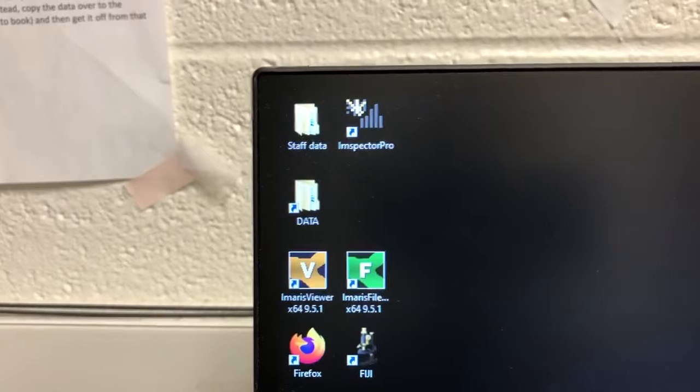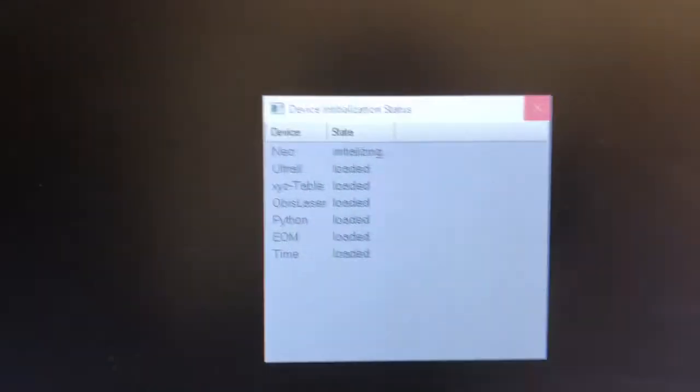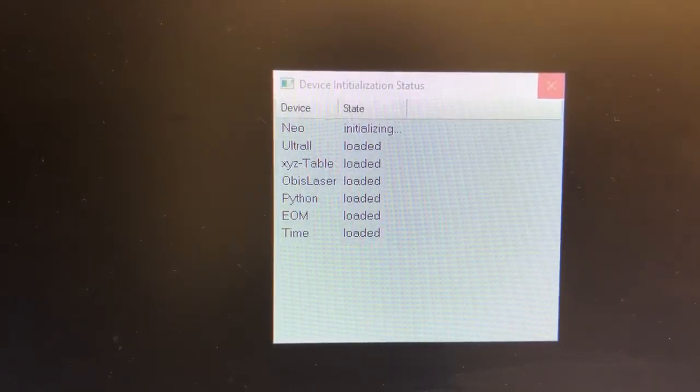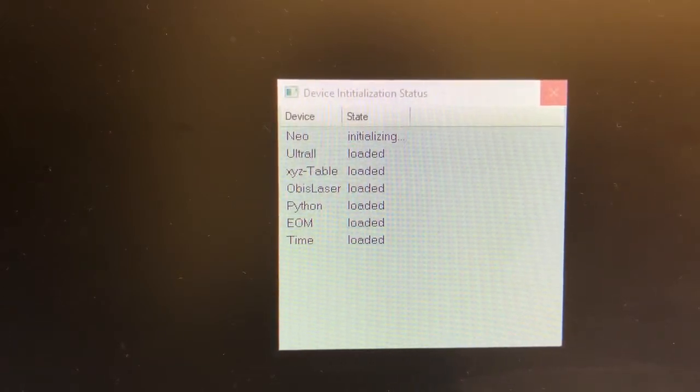The software we're going to use is called Inspector Pro — I'm going to double-click on that and the software is going to start. You'll see here there's a device initialization status. This should not show any errors; if it does, please contact the staff. You have to wait a little bit to get everything going.